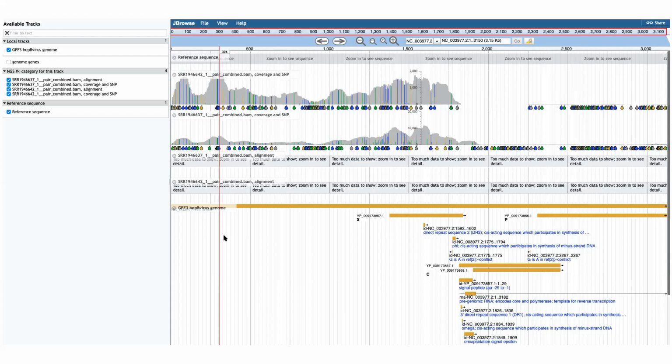How did you determine that? Well, let's take a look at more reads for the one on top, says Emeka. 637 is a tumor genome, 642 is a non-neoplastic one, the non-tumor.